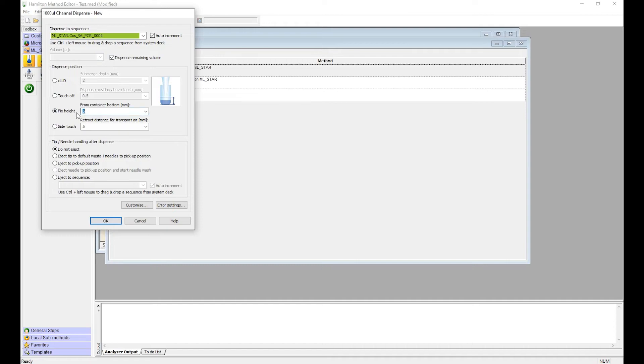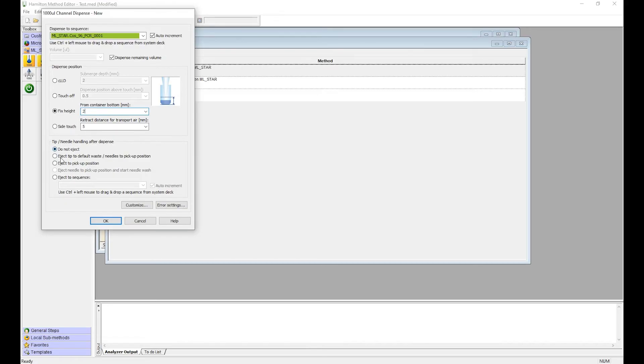You can change the height at which you dispense. We're going to do it about two millimeters from the bottom and select where you want your tips to go. You can either have it stay on the channels, eject into the waste, or eject back into the tip pickup position, which we're going to do today.